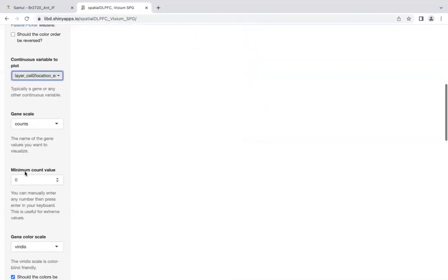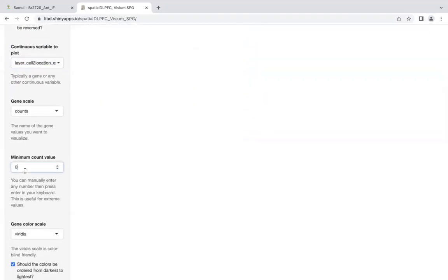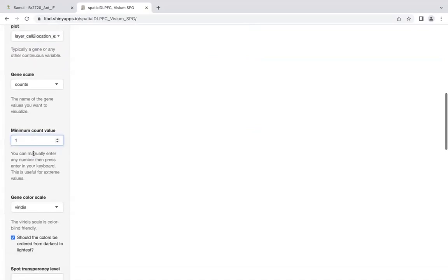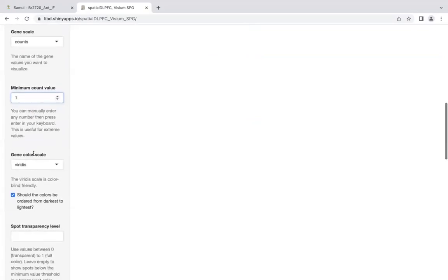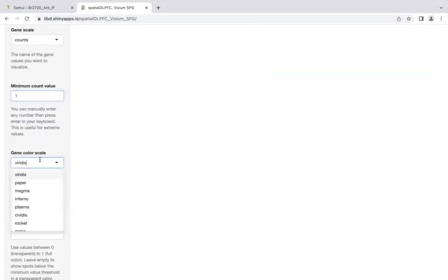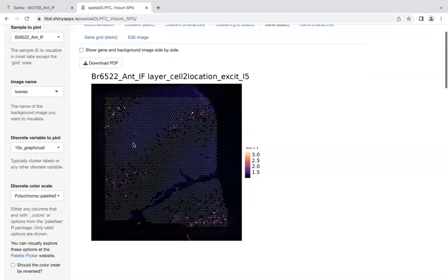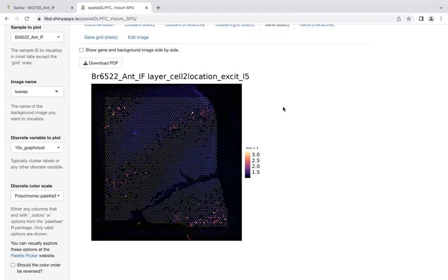There's a lot of customization that can be done as well. Let's say we want a threshold to counts that have at least one, basically filtering out zeros. We can change the color palette. Let's say I'm interested in seeing it in magma. Now we have this thresholded image with a different color palette. There's a lot you can do here.